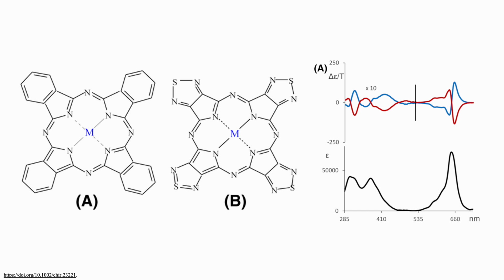And from that UV-vis spectra, it tells us where to look. So that really strong, intense peak around 650 nanometers is called our Q band. And the MCD signal related to the Q band is related to energy splitting between the two HOMO and energy splitting between the two LUMO. So we were able to get that information from our UV-vis and then use DFT calculations to compare to our MCD spectra to characterize the HOMO and LUMO here.